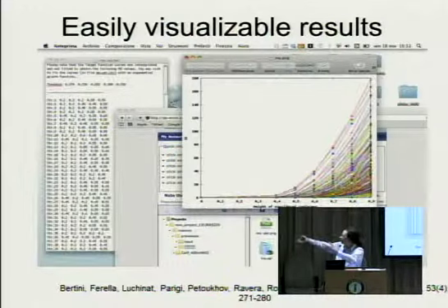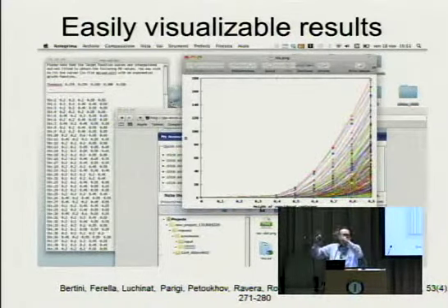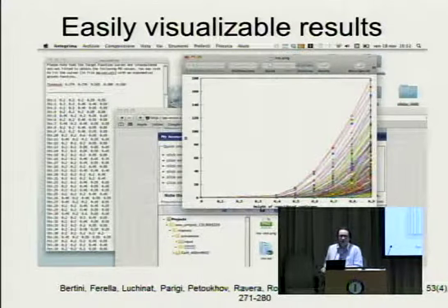The program just needs to pick 50 structures among 50,000, which you can combine and then get the data satisfied. But the trick is when your one configuration is weighted a lot, then the program is not able to do that, and you start having discrimination. But actually, you spend a lot of time computing this because it's always successful. The program spends a lot of time to optimize these ensembles.